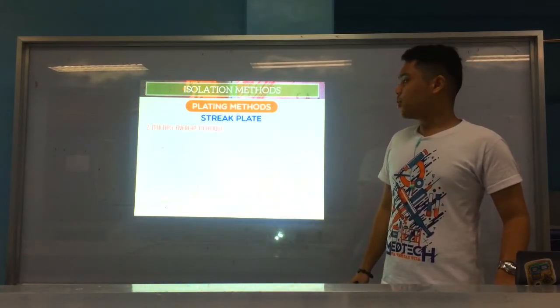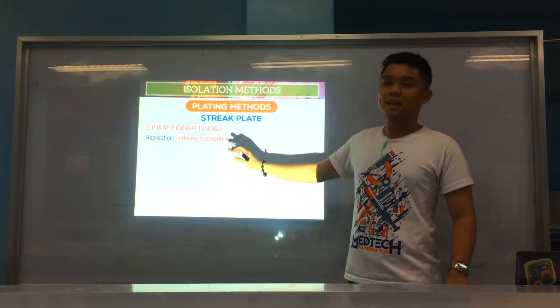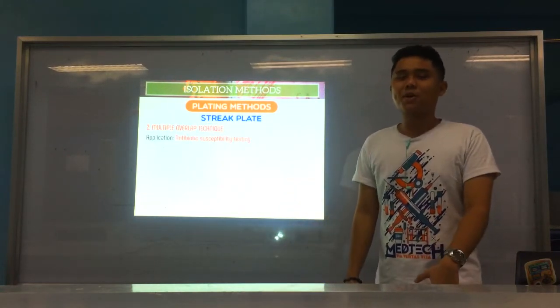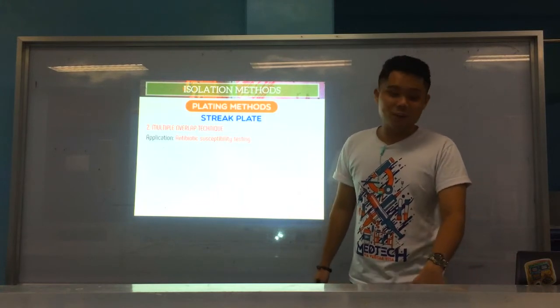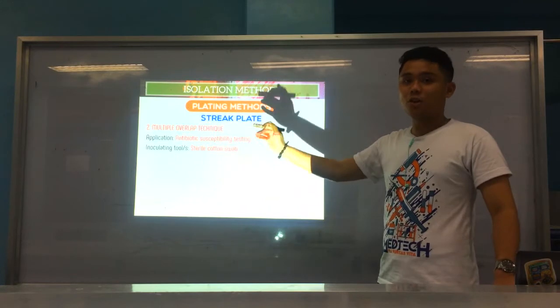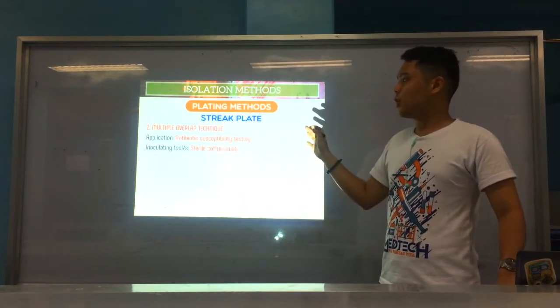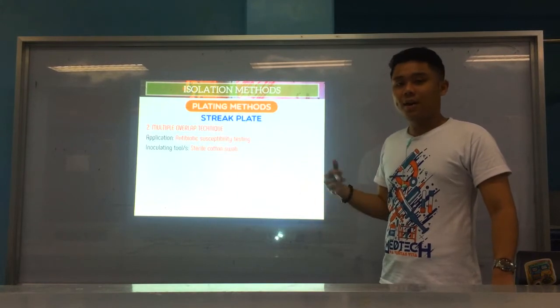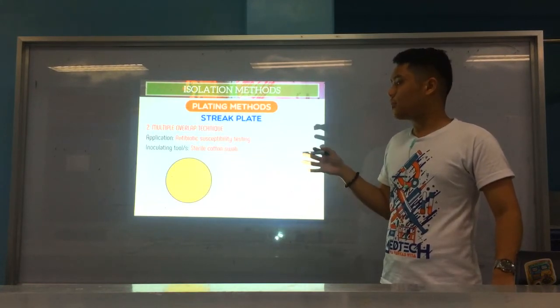Okay? Next, you have your multiple overlap. This is usually used for antimicrobial susceptibility testing. The culture media for antimicrobial susceptibility testing is your Mueller Hinton Agar, MHA. Alright, and what we use is a sterile cotton swab, okay? We'll have a discussion on antimicrobial susceptibility testing later in the laboratory. But for this, we'll talk about multiple overlap.